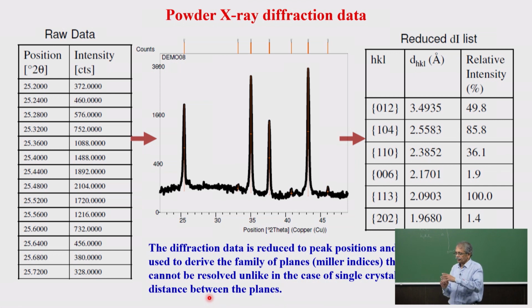So one of these things may be cancelled by the other, etc. You get only a few. That's why you get a much smaller number of peaks in the diffractogram with the powder or polycrystalline material as compared to one single crystal. One single crystal will be completely aligned, so all the reflections you will get quite well.